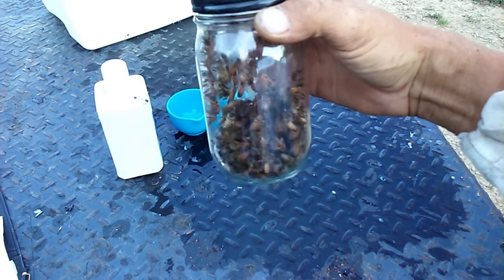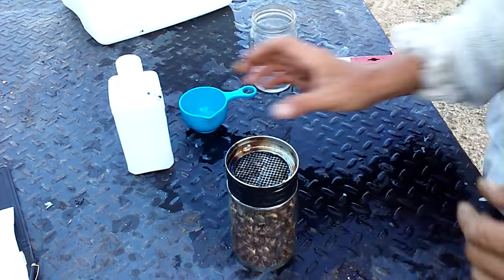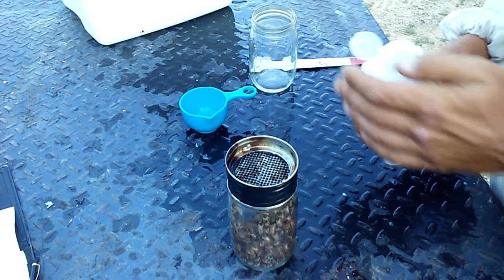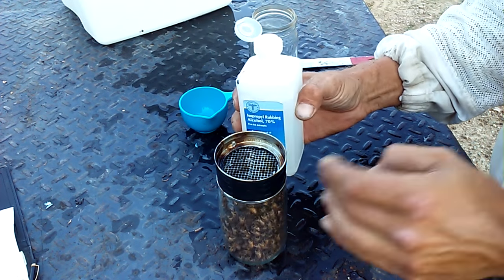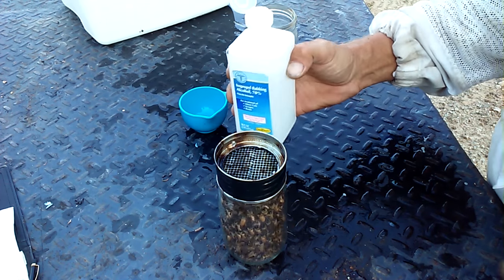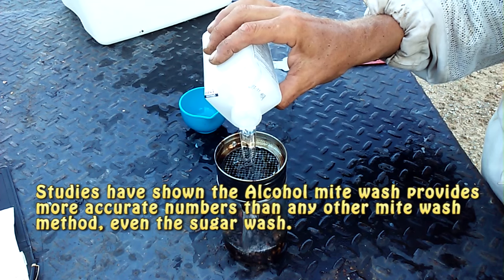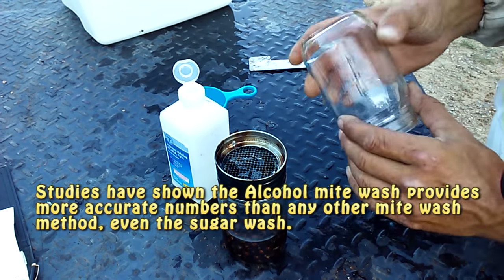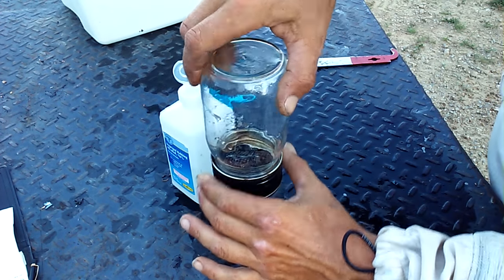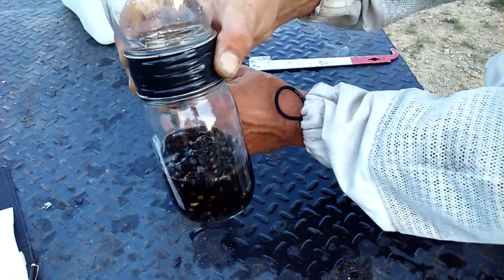We've got approximately 300 bees here in our mason jar. Now what we're going to do, we're going to take a little bit of rubbing alcohol and we're going to wash them. Now this rubbing alcohol will kill the bees, but you've got to tell yourself you're doing this to benefit the colony, so you have to do it. Then I'm going to take my other mason jar and screw it on top, and we're going to shake it. What this is going to do is finish killing the bees and also dislodge any mites that are on the bees.